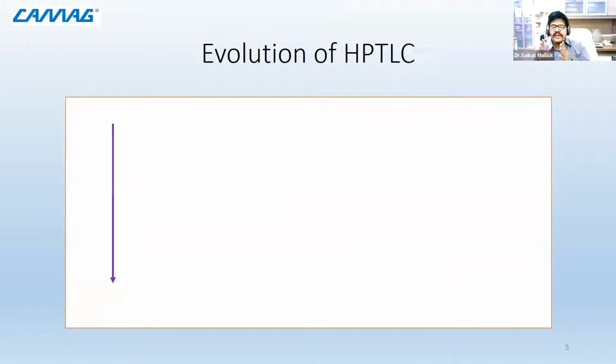So TLC is kind of a routine work which many of us have done, and I will explain the difference between the two as and when we move through the slides, because there is a vast difference between them, although it's just a prefix which is being added over here, that is HP, which stands for high performance. But technically it means a lot of things; the approach is different.